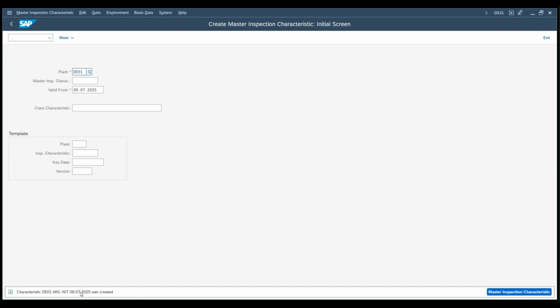Keep in mind that if we go and try to use this for yesterday, let's say, the characteristic does not exist, because it has a validity period starting from today. When you are doing this for a project, for example, you normally define the start of the month, to avoid any conflict with the usage of this.